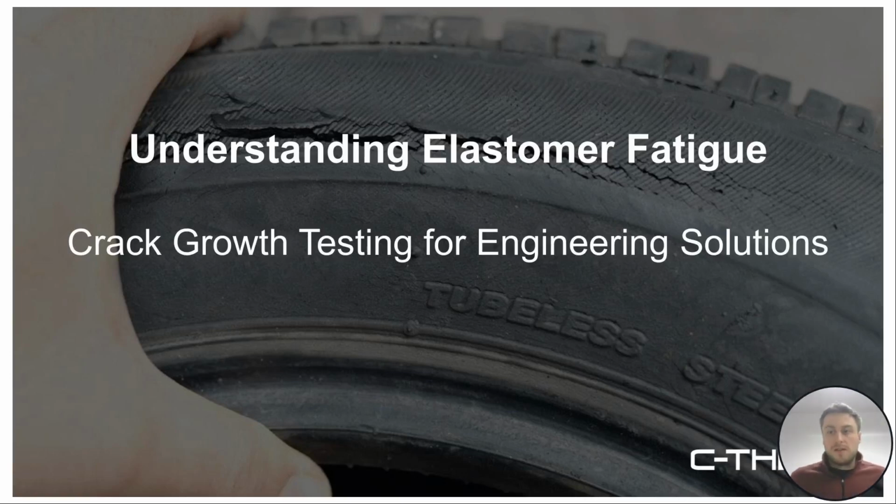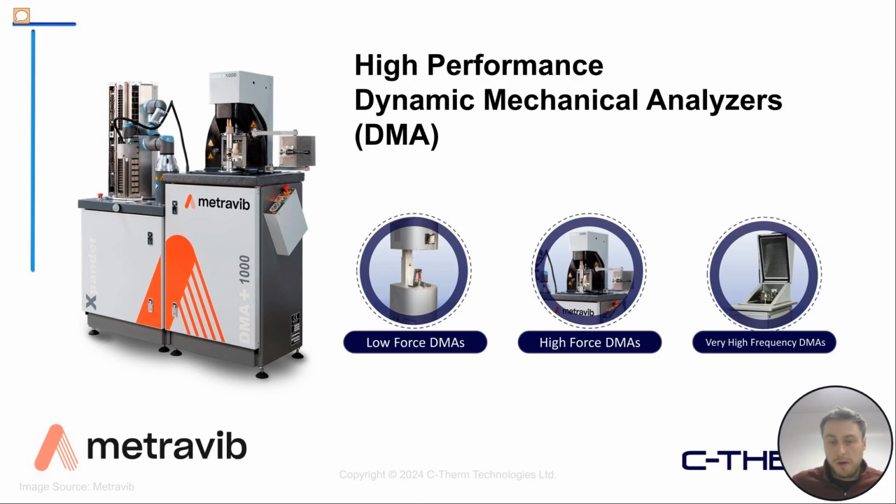Okay, awesome. So again, thanks for attending the webinar today. Our webinar today is titled Understanding Elastomer Fatigue, Crack Growth Testing for Engineering Solutions. So today we'll be talking about one of our third-party lines, the Metravib DMA, or dynamic mechanical analyzers. So we'll be focusing on this equipment and how you can use it to analyze crack growth and fatigue performance. And we'll go through a couple case studies later on.